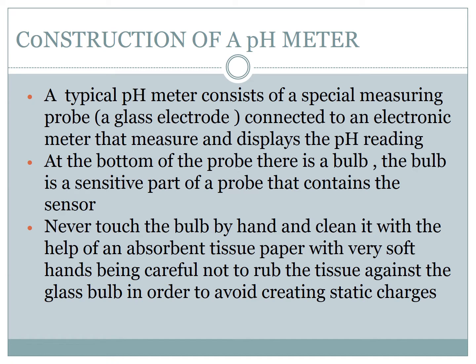At the bottom of the probe, there is a bulb. The bulb is the sensitive part of the probe that contains a sensor. Never touch the bulb by hand, and clean it with absorbent tissue paper with a very soft hand, being careful not to rub the tissue against the glass bulb, in order to avoid creating static charges as well. We are not supposed to touch the bulb with a naked hand, that is harmful.